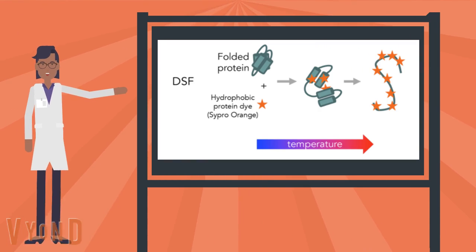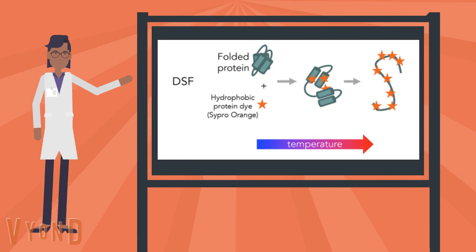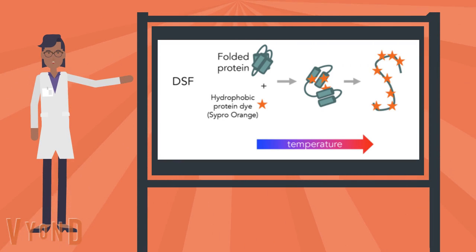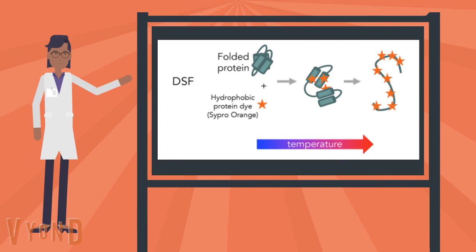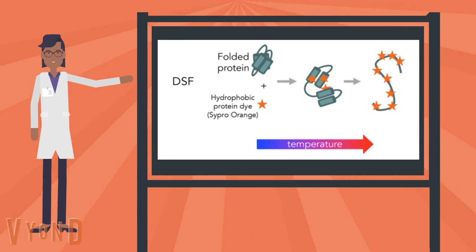So now that we know a little bit about the history behind DSF and how it has been adjusted into what we now know to be DSF, let's talk about how it works. DSF is considered to be a type of thermal shift assay, and a thermal shift assay is run to measure the changes in thermal denaturation temperature, which basically means that it looks at how a protein unfolds at different temperatures.